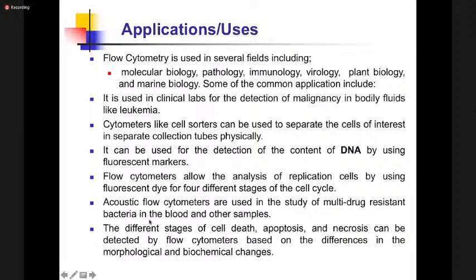And I mentioned to you also the acoustic flow cytometer, which is just the traditional cytometer, but uses a different laser compared to the flow cytometer, which are used to study multi-drug resistant bacteria. And this is quite important for studying why there could be a drug in a store, maybe approved for supply by KEMSA, but you as a doctor, you are treating this bacteria and you're not seeing anything working.